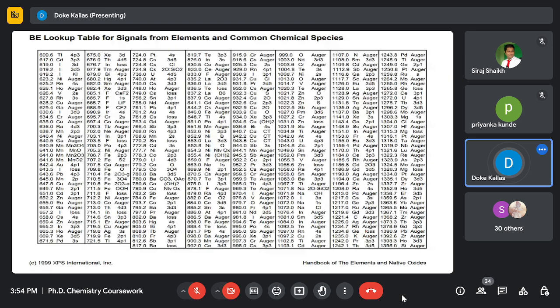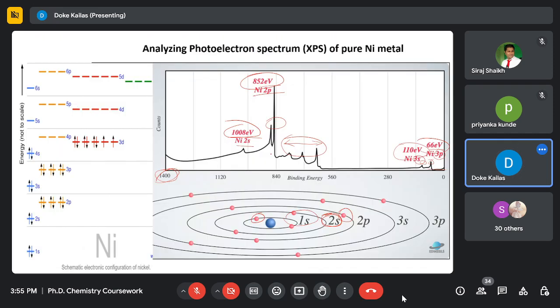It is the binding energy of nickel having 3p electrons. We must know some properties of the elements, so we know that the sample is nickel, so the nickel peak will be there. This way, the spectrum peaks are analyzed: 3s electron, 2s electron, 2p electrons. This doublet is not analyzed over here, and this is not analyzed.